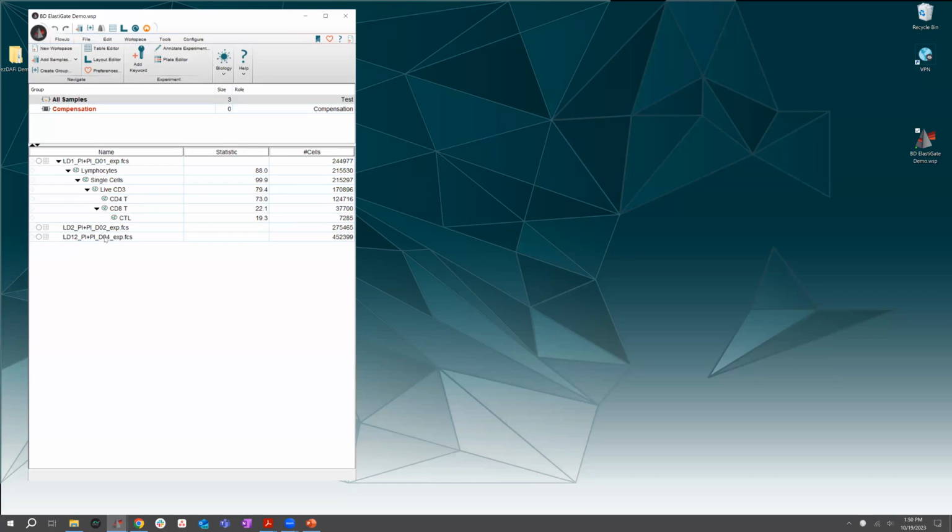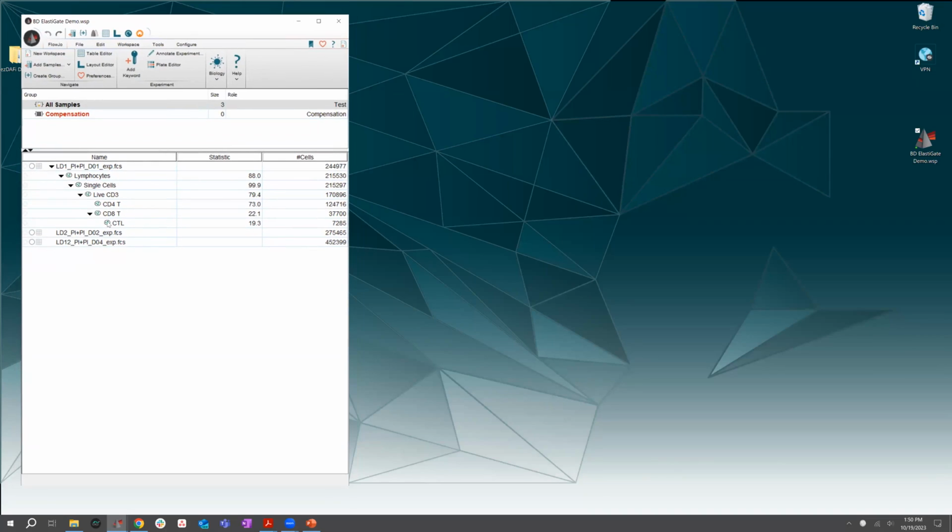They don't have to be unanalyzed. But the idea here is you would really only need to dedicate a lot of effort to one sample because it's going to group apply those gates anyway. Okay, so up to you. But if you have already an established hierarchy on the other samples, it's totally fine.